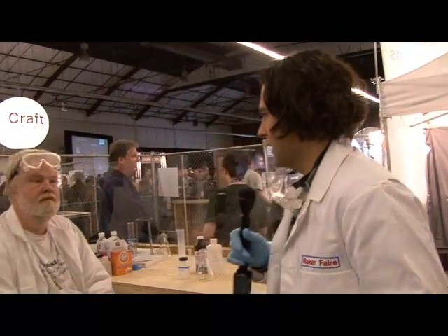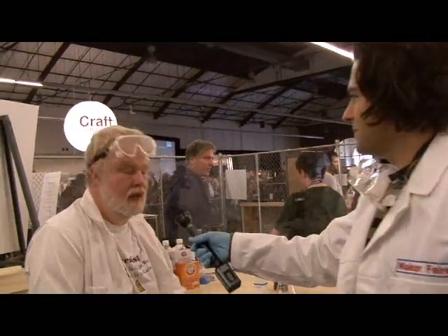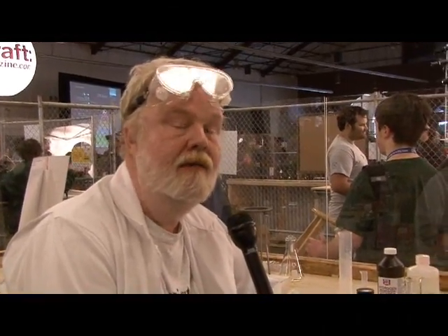And I'm here with — maybe you can introduce yourself a little bit. Hi, I'm Bob Thompson. I'm the author of The Illustrated Guide to Home Chemistry. And Phil asked me to talk a little bit about one of the changes we made very close to the time the book actually went to the printers.